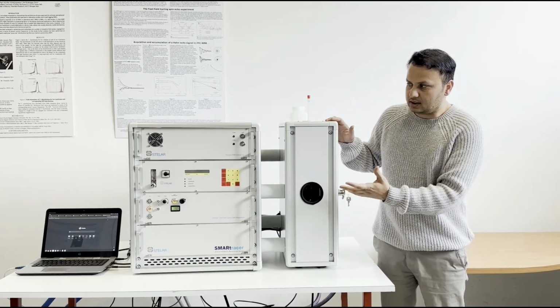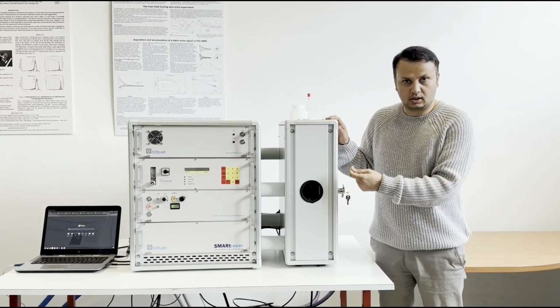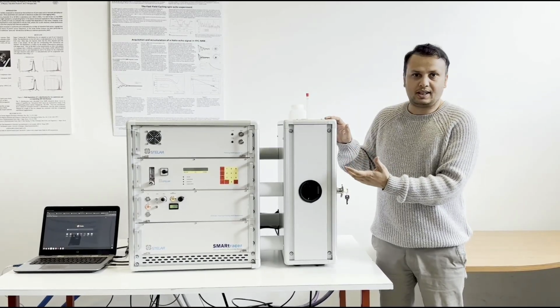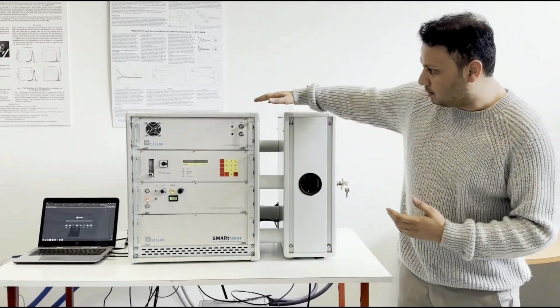Today for our training we are going to use this instrument, and I will explain to you its main characteristics, how you can switch on this instrument, how you can use it, and what capabilities it has. As you can see here, this instrument has two main parts.